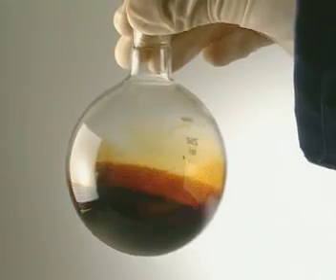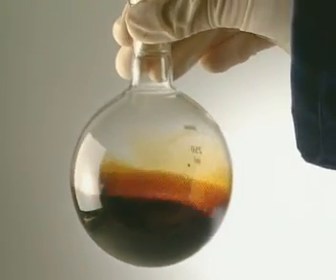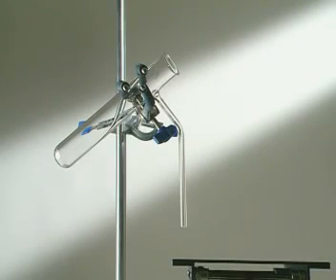But as a mixture, it's useless. The different hydrocarbons need separating. The technique used is distillation.